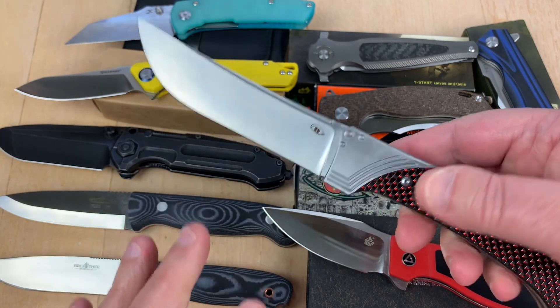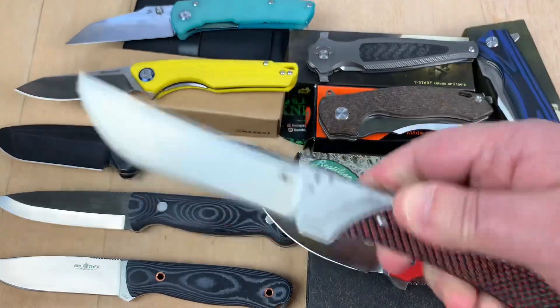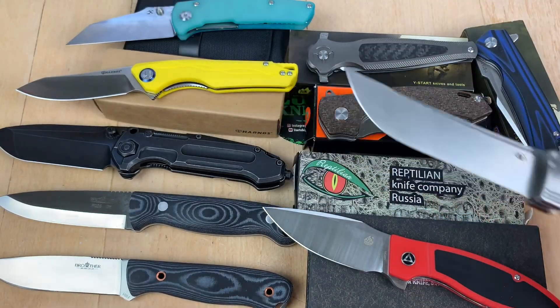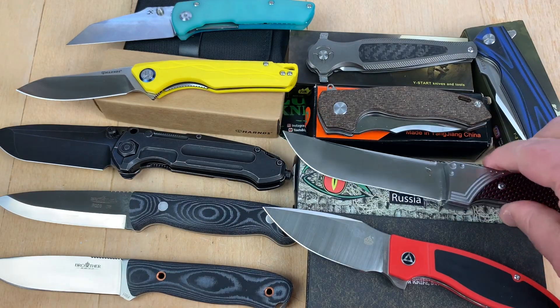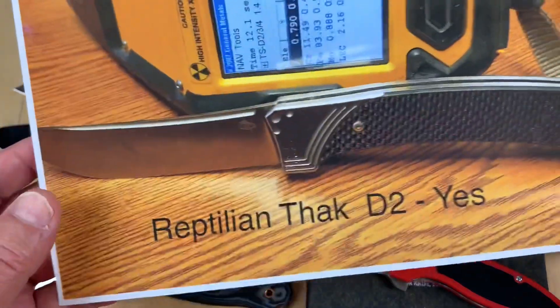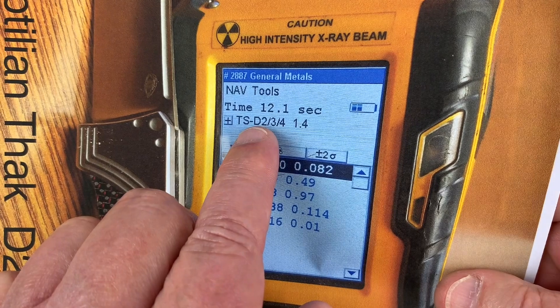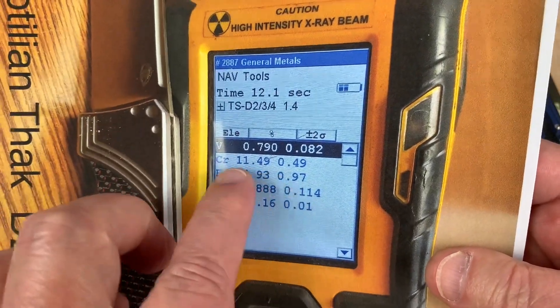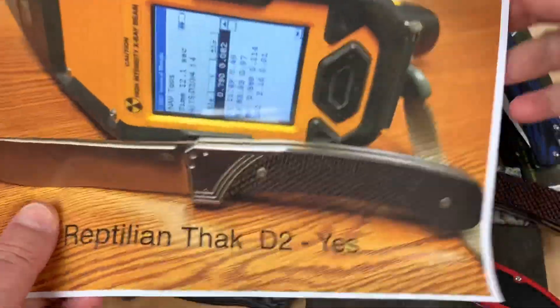This is the Reptilian Thak — a big knife with a scale actuated mechanism. I got it from the Knife Nuts podcast. It supposedly is D2. This came from Russia — I'm not saying it was made in Russia, just that it came from there originally. Is the Reptilian Thak really D2? Yes. The analyzer picks up D2 because it's in its programming — you can see 11.5–12% chromium, your vanadium level, et cetera. It's really D2.